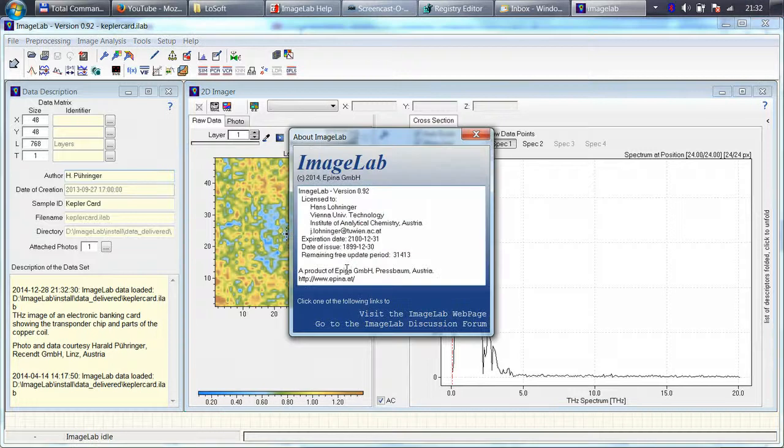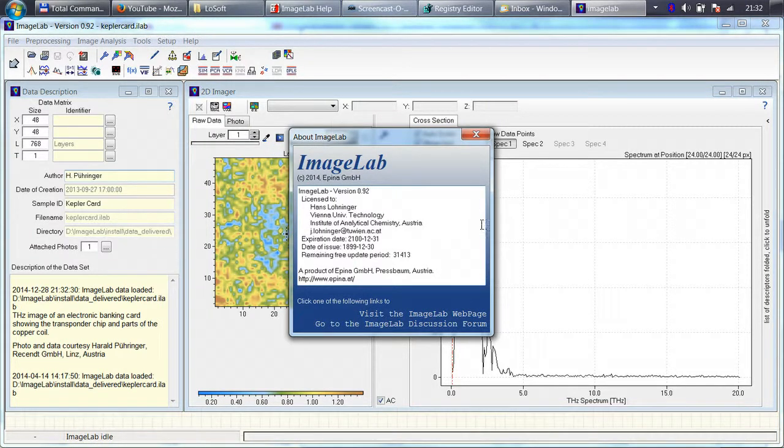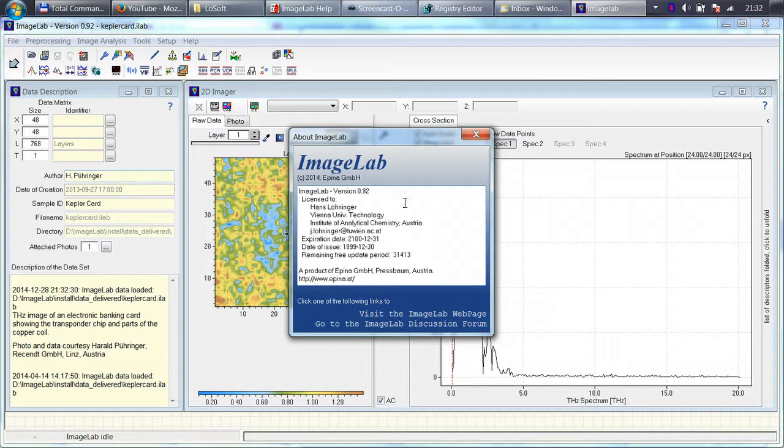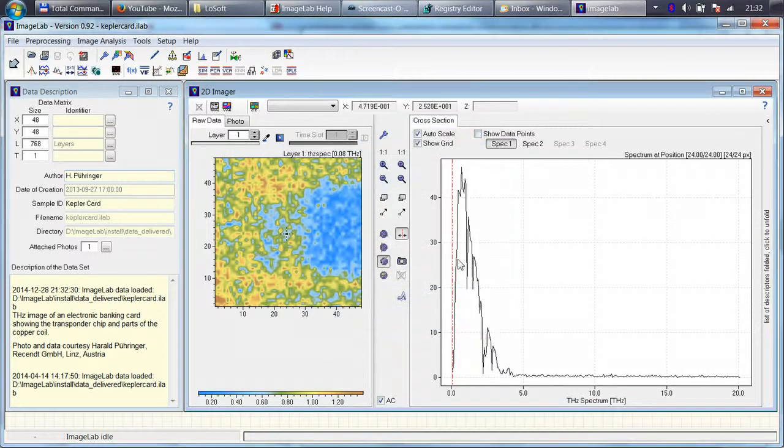ImageLab is switched into the full mode. You can see here the details of your license and from now on you can just use it without any restrictions.